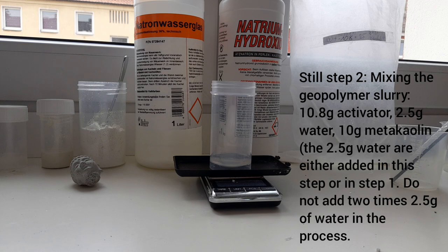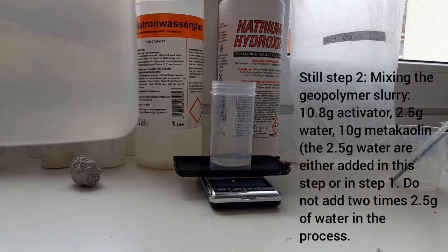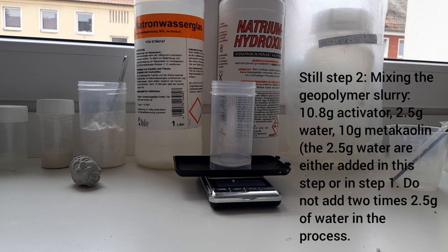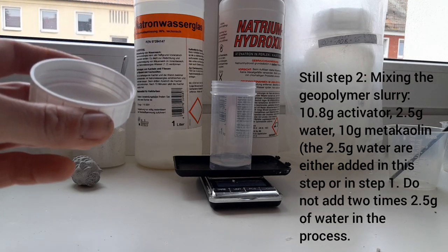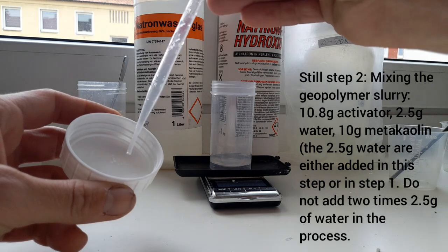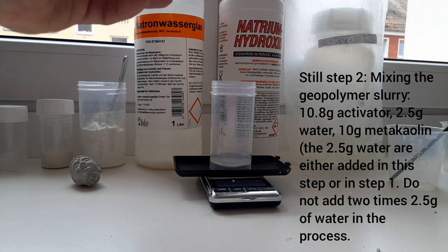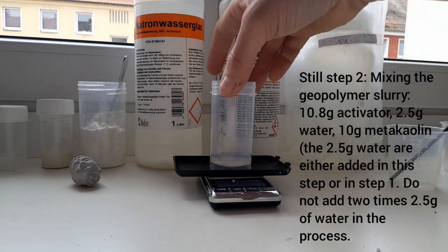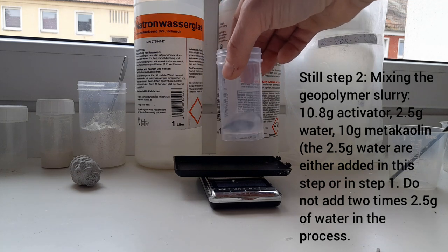Close the solution as the hydroxide ions in it can react with CO2. I notice in this recipe the water is not added in the activator solution, so I have to add it at this stage. I'll start with 1.5 grams.